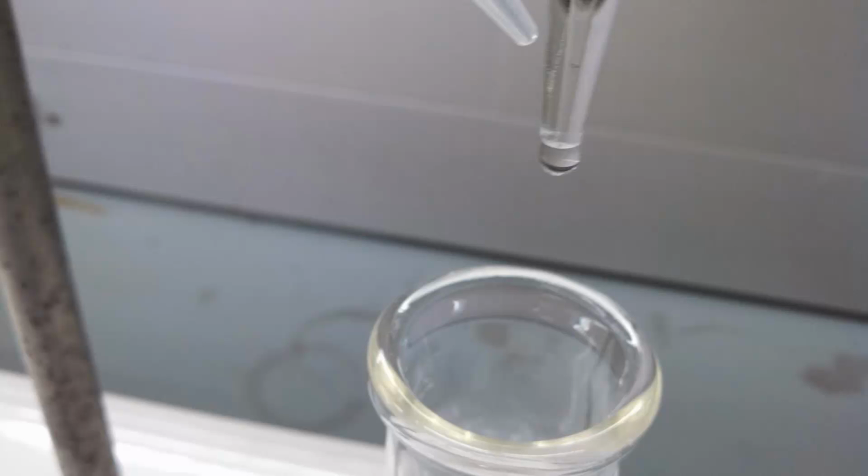The reason that this can be done is that the total volume in a titration doesn't matter. It's also why we tell you to add about 100 milliliters of water to the flask. What matters is the number of moles of sodium hydroxide and the number of moles of KHP. You can add water at any point, as long as you don't dilute it so much that you can't see your indicator. You're not going to hurt your results.